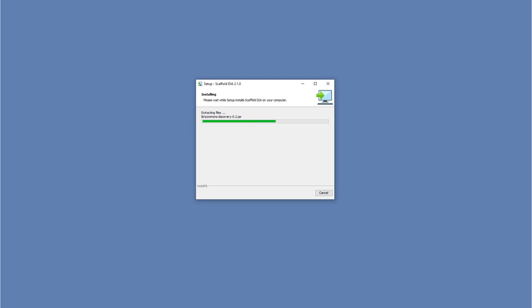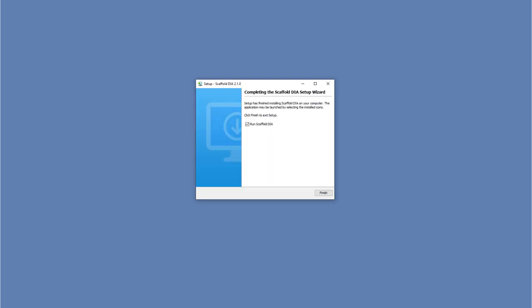The program should launch automatically as long as the Run Scaffold DIA checkbox is filled in. You can now enter your license key.